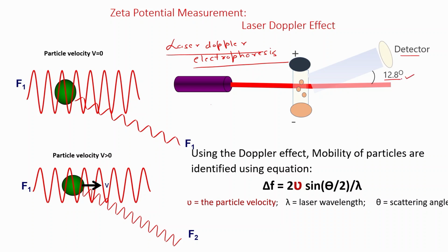Now this angle is selected based on the fact that it provides a balance of sensitivity, accuracy, and practicality.